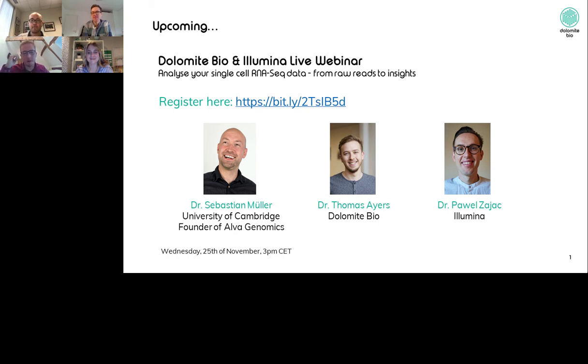So you did touch on an excellent point there, where always consider that if you have a tissue that's difficult to dissociate without turning it to mush and just making all the mRNA from dead cells go everywhere, if that's the difficulty, always consider that there is the possibility of single nucleus RNA sequencing, where granted there are differences between a nuclear transcriptome and the whole cellular transcriptome, but if it's the difference between getting a good snuc-seq run and a kind of rubbish single cell isolate, you can consider snuc-seq in that case, and that is a standard operating protocol on the Nadia as well.